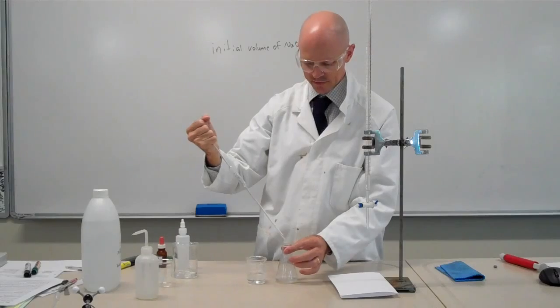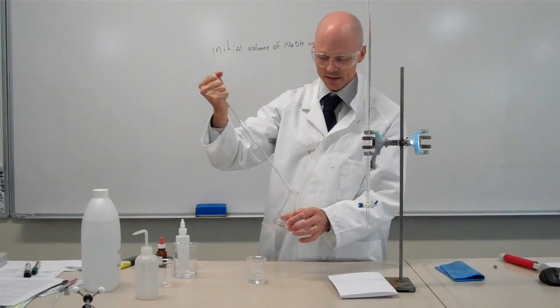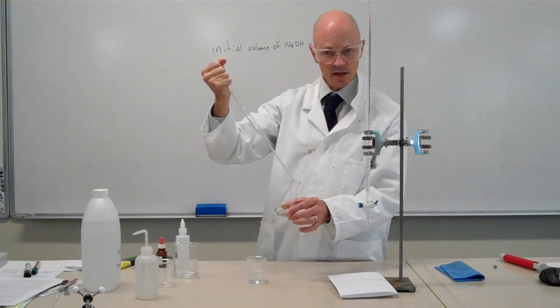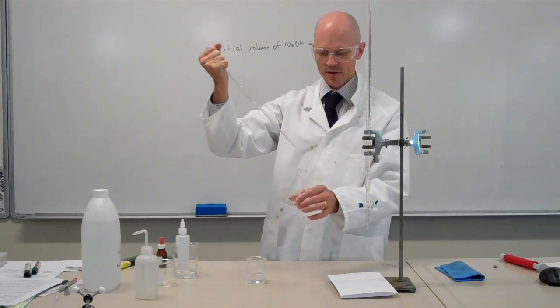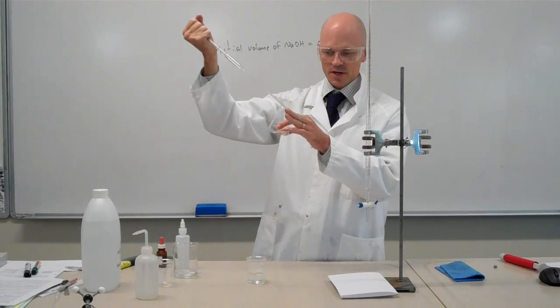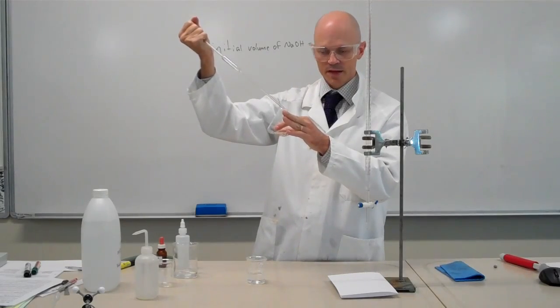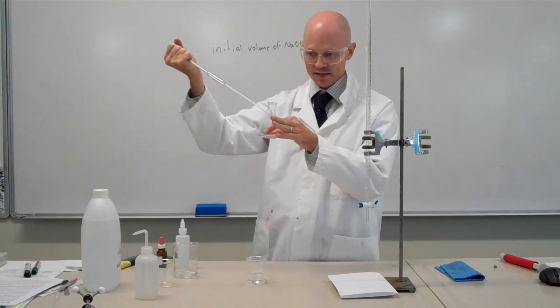Once you've been towards the end of draining your bulb pipette, touch the end of the pipette to the side of the flask. That draws out just a little bit more of the liquid. You are left with a tiny bit of liquid in the bottom of the bulb pipette. It is designed to be there. So that's 10 ml with that still remaining there.